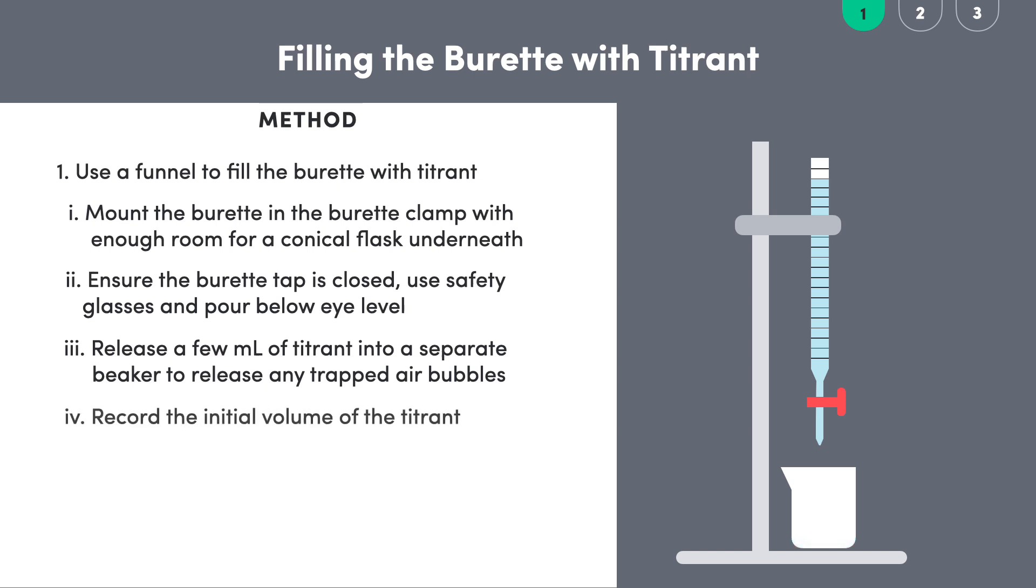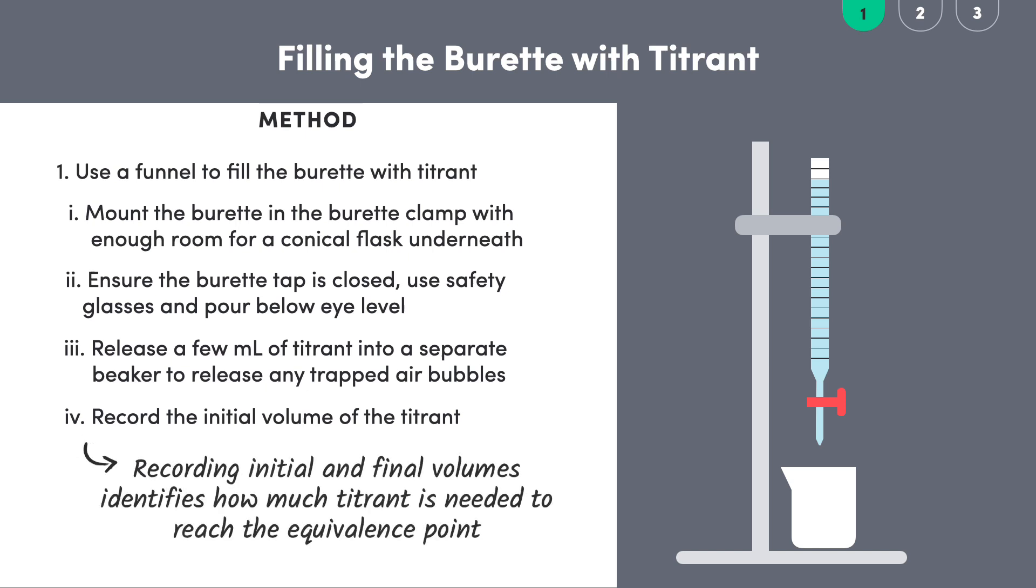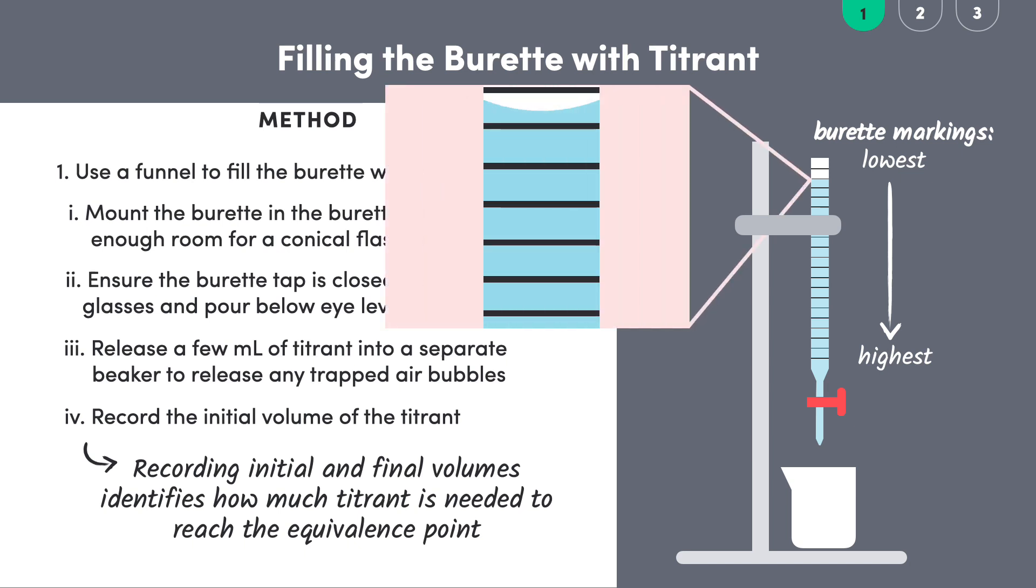At this point make sure to record the initial volume of sodium hydroxide in the burette. We need to know the initial and final volumes of titrant after each run of the titration so that we can precisely identify how much was needed to reach the equivalence point. Take note that the markings on the burette go from lowest at the top to highest at the bottom. Also be sure to read the value that corresponds with the bottom of the meniscus and from eye level to avoid parallax error. So here we'd mark down the initial volume as 2.35 milliliters.